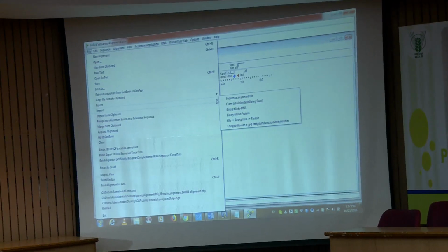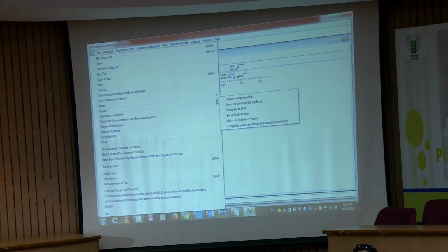The software which we are using will ask for AB1 files only, because that is the actual file generated by the instrument. In ACGT, you can write any sequence, but this file you cannot change. The peak color will recognize the base: for example, black peak is this, then this is G, or C is blue.